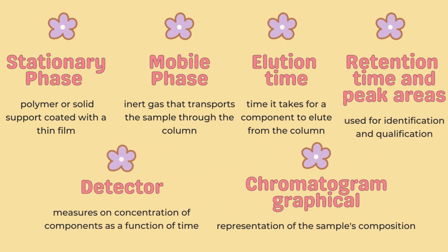Gas chromatography is an analytical technique for separating and quantifying components of complex mixtures. It relies on the principle of different partitioning between stationary and mobile phase. The sample is injected in gas or liquid form and carried through a column. It is versatile, with high separation efficiency and sensitivity, and a valuable tool for analyzing complex mixtures and trace components. Applications: environmental analysis, food and beverage testing, pharmaceutical analysis, forensic science.